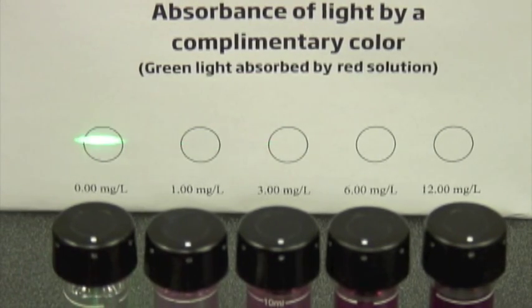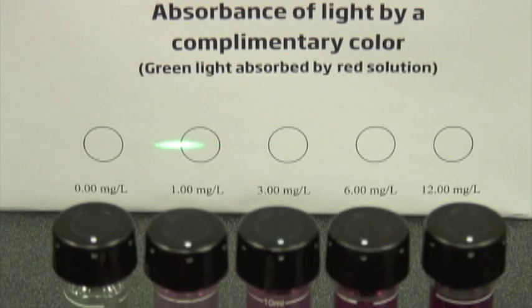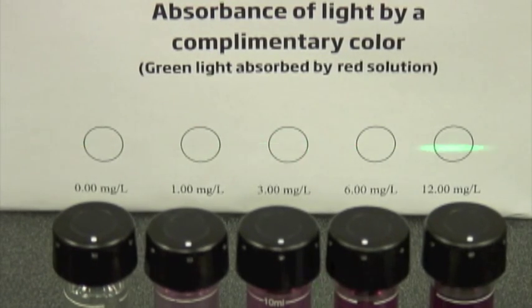As we go into the clear solution, it still retains a lot of that brightness — it's a little bit distorted because of the glass, but it still retains its overall power. We go back into air, still bright. A little bit dimmer with that one, not too much. We go back into air, again it goes back to being bright. And now we're starting to see some real dimming occurring here — it's substantially less bright than it was previously. By the time we get down here, it's even more dim. And finally, our last solution, it's almost barely visible.